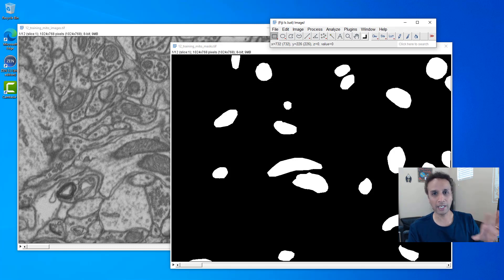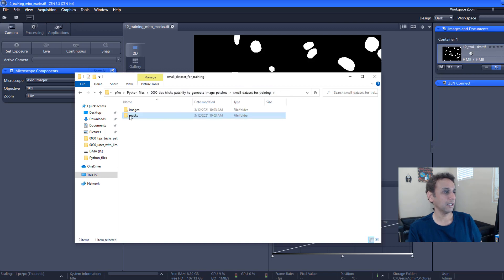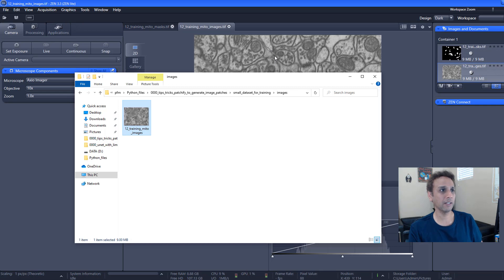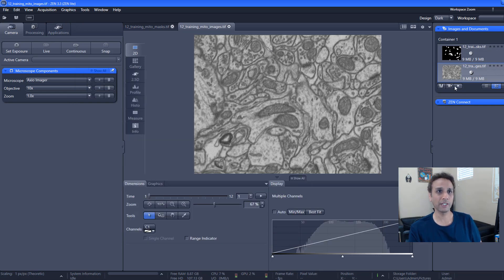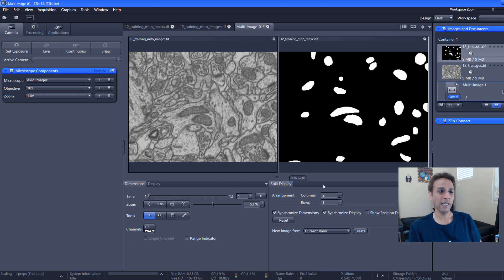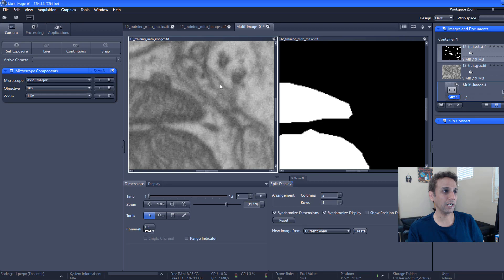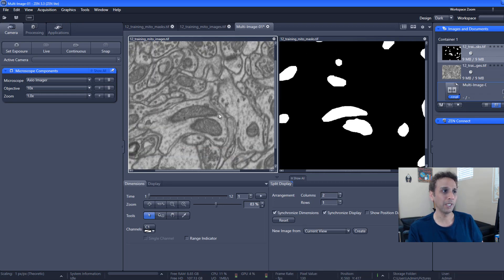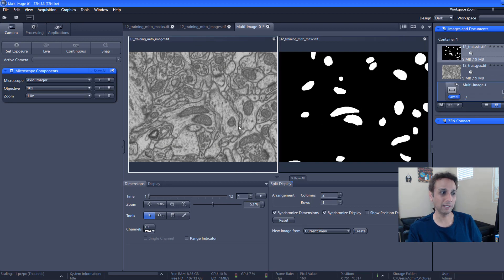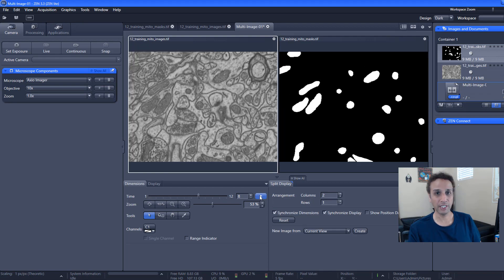That's a quick overview of ImageJ. Now if I do the same with Zen, I can again open — let me go back to my masks image. I can open the masks, which are TIFF images. You will see all the images on the right-hand side. There is a way to create multi-view, so on the left side I have one image and on the right I have another, and you can select how many images you want and compare them all at the same time. Things are synchronized already when you bring them into multi-view mode. Since this is a time series, I can go through each time step and see how things are actually changing or moving.